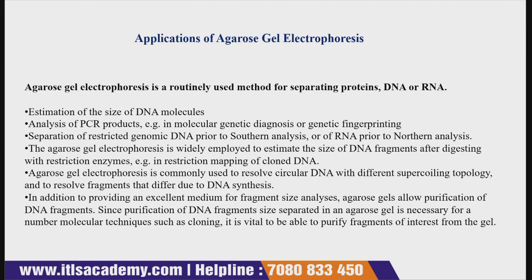So this one is again very important. Apart from separation of macromolecules, it is also involved in the purification of DNA fragments. Since the purification of DNA fragments is size separated in an agarose gel, it is necessary for a number of molecular techniques such as cloning. It is vital to be able to purify the fragment of interest from the gel. So apart from the separation technique, it is also involved in the purification of different DNA fragments.